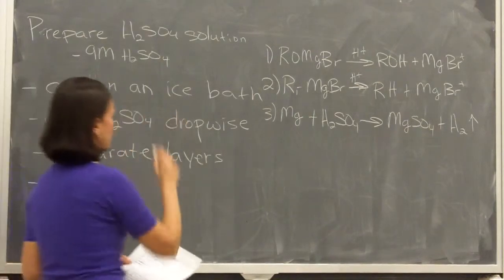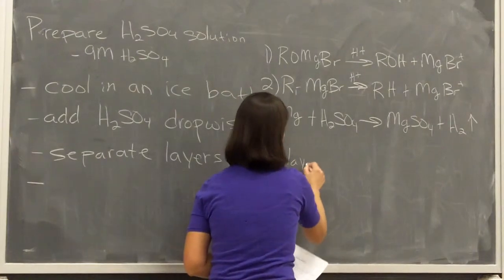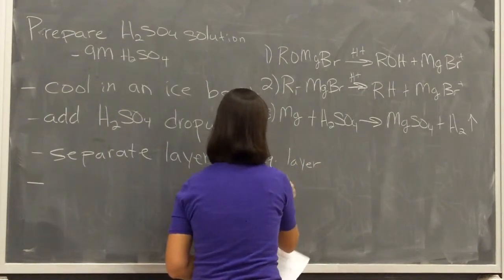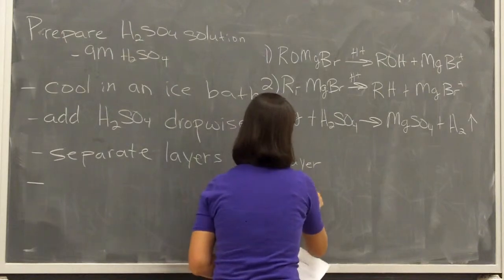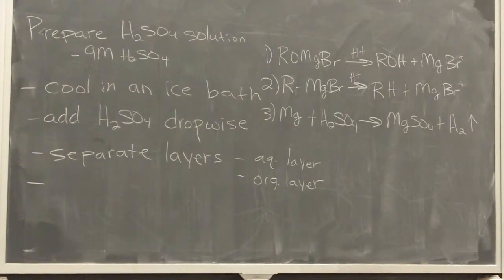So, we've got our aqueous layer, and we've got our organic layer. And to help you out, the flow chart for this reaction is drawn in your lab manual.